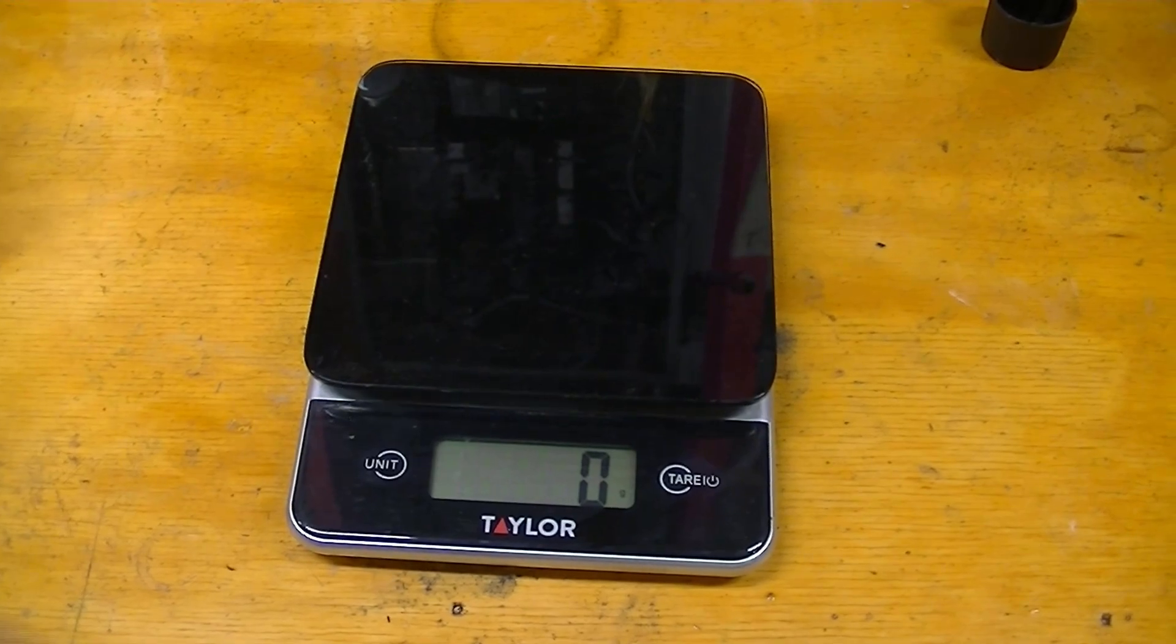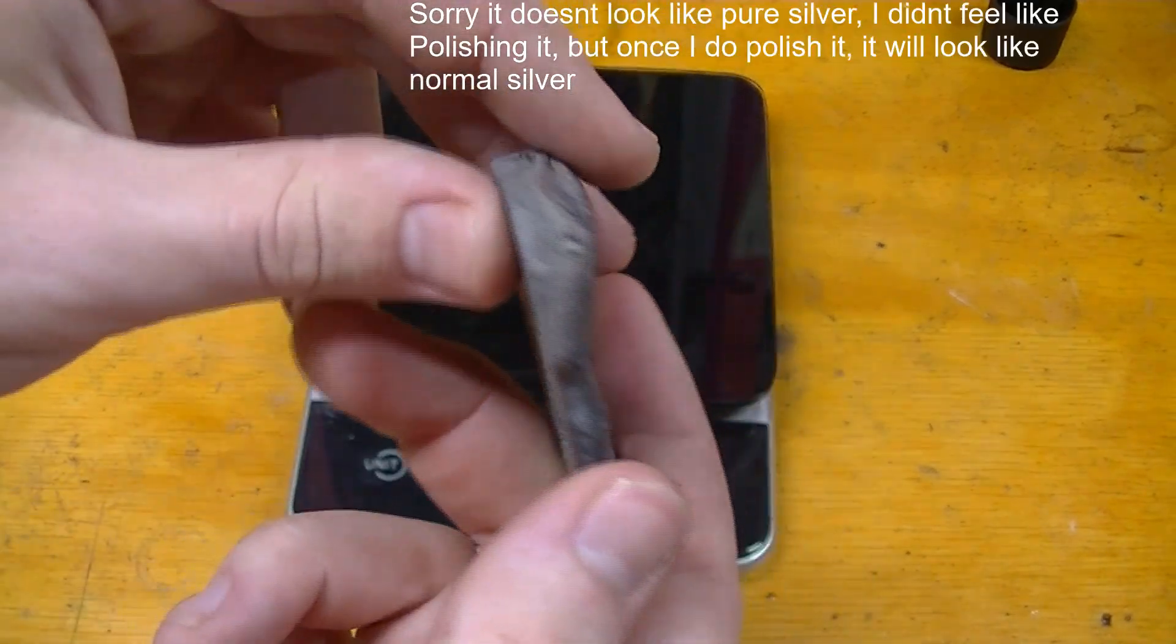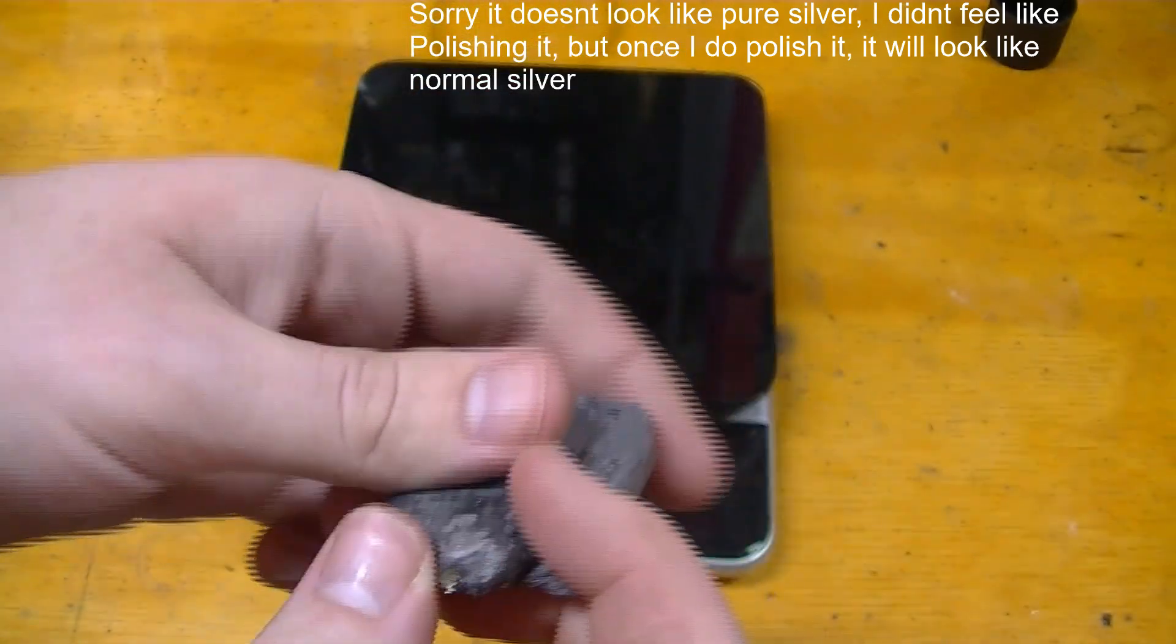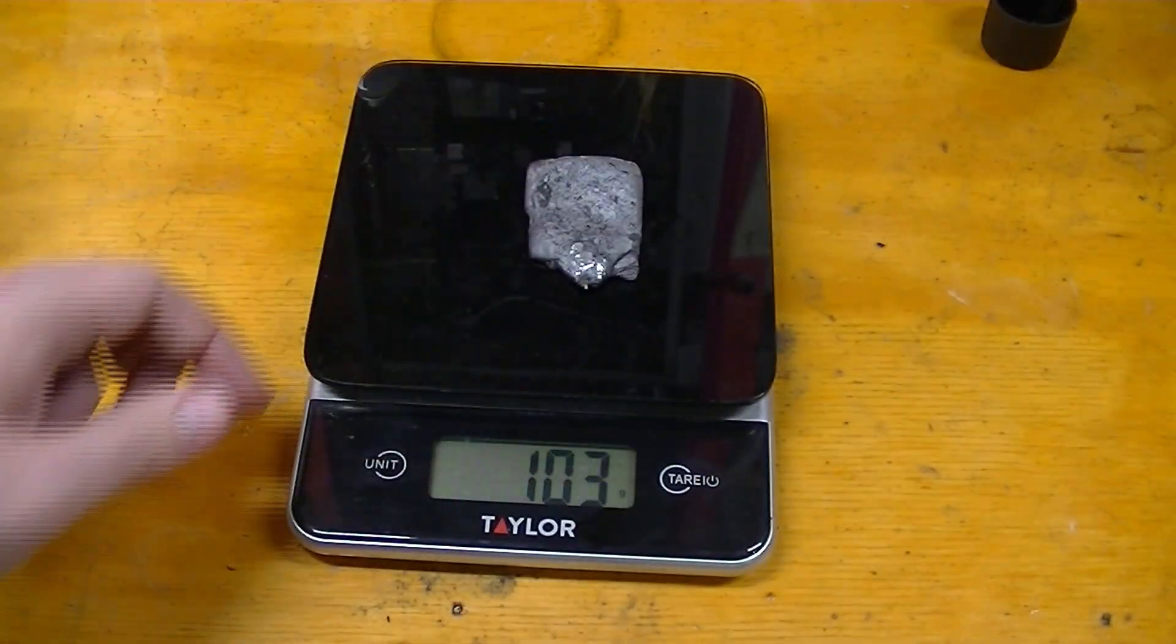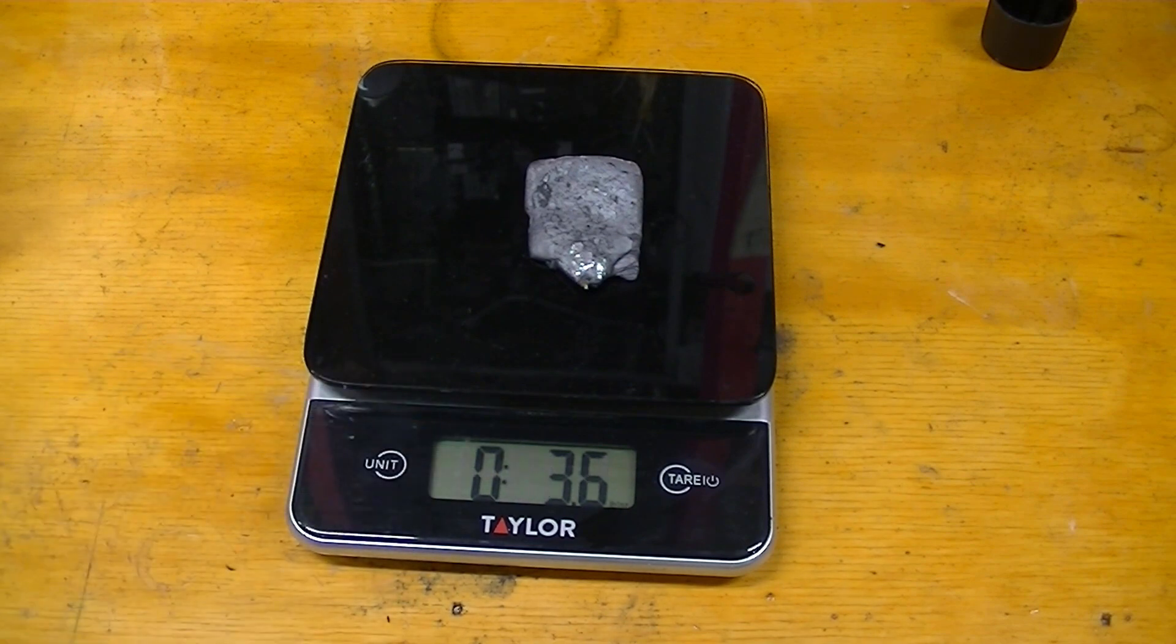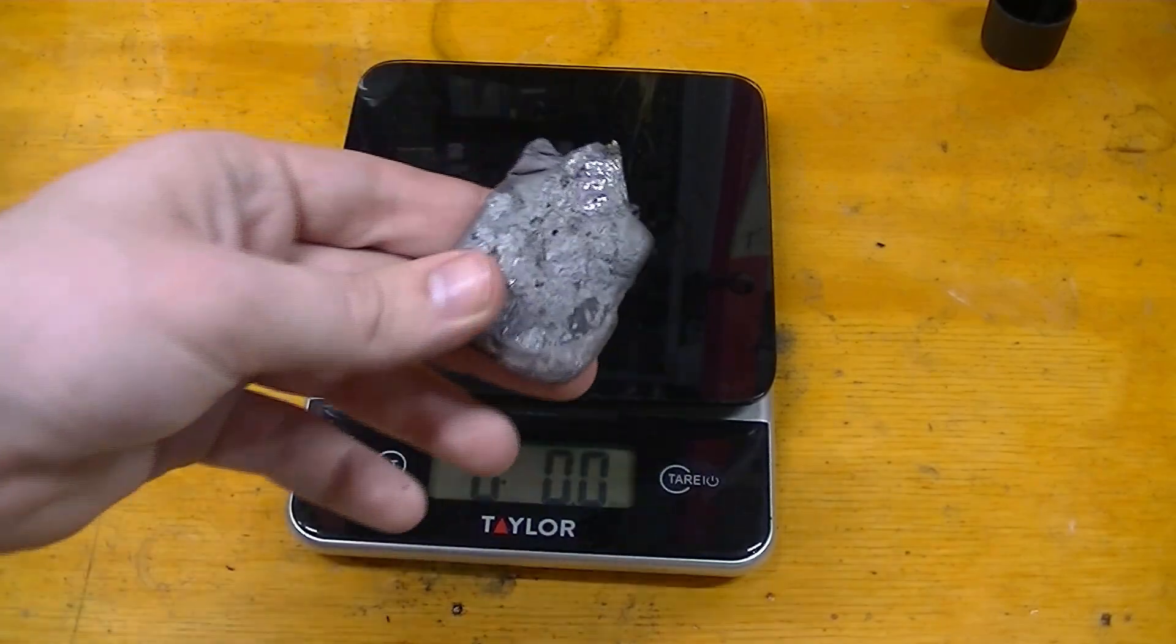All right guys, you just saw the work we did. This was the product of that. Pure silver weighs 103 grams or 3.6 ounces. And last I checked, silver right now is about $17 an ounce, plus a little bit more if you have the actual silver.